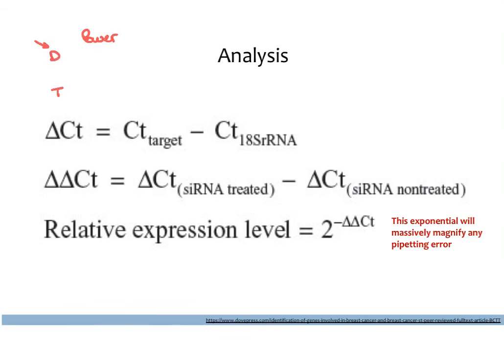So obviously DMSO is our control here. And let's say that our power values were something simple like 0.1, 0.2, 0.3. And our TMZ values were also pretty simple. Maybe we have a 3 and a 1 and a 2. This is probably not what you'll have, but we'll just, for the sake of argument. So what we want to do is make the average of DMSO 1. So we want to calculate the current average of DMSO, which should be 0.2.